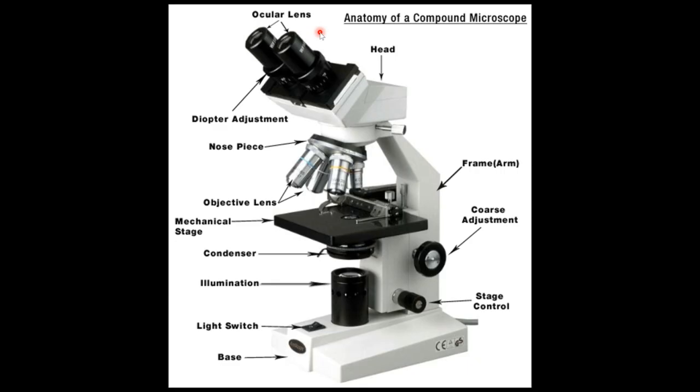So you have to use the high power, but it's also good because that gives you a little bit of exercise. If you've got microbiology in your future, then you're going to quickly become an expert at using these microscopes. If you've already had microbiology, you know what I'm talking about. You use the microscope extensively in microbiology because, well, the cells are so small.